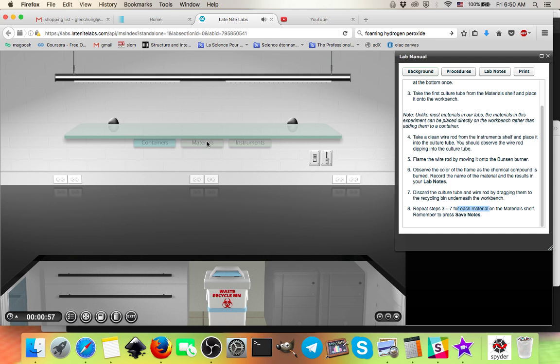Let me show you the materials. You see there are many materials here. These test tubes each contain a certain compound or metal. And the number that you see there, the 1 followed by an M, refers to the concentration of the solution. So these are solutions, mostly. I think there's some of these that are not solutions. No, they're all solutions. Okay, so I just want you to do 5 of these.